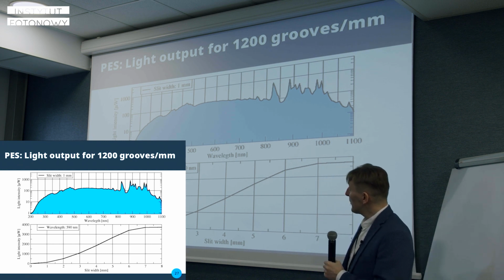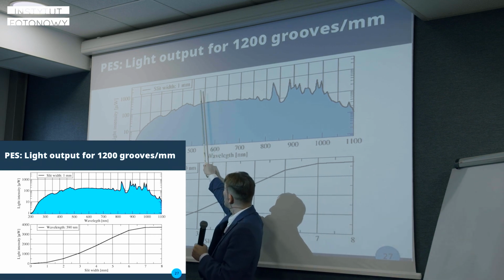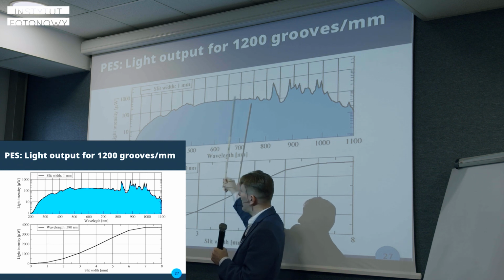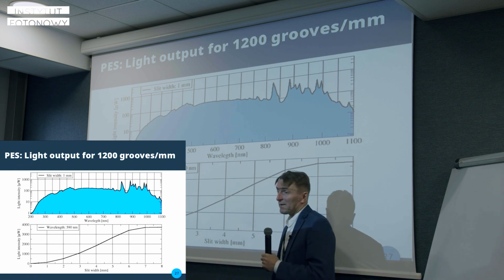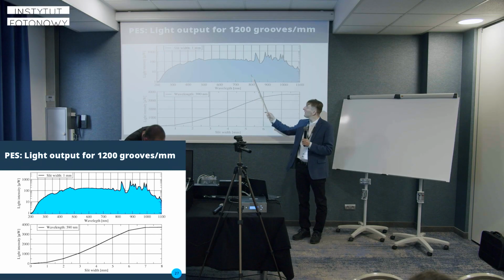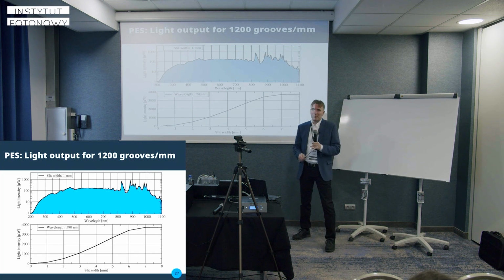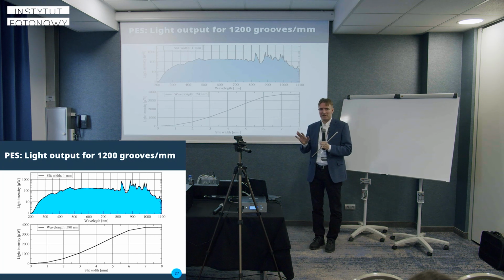So our monochromator can pick one of the wavelengths here and deliver it to your sample. But it cannot really adjust the amplitude of the light, I mean the intensity of the light, because a xenon lamp is not great for adjusting the amplitude.